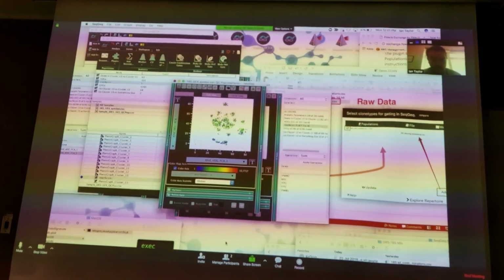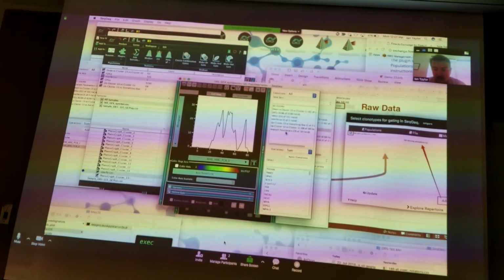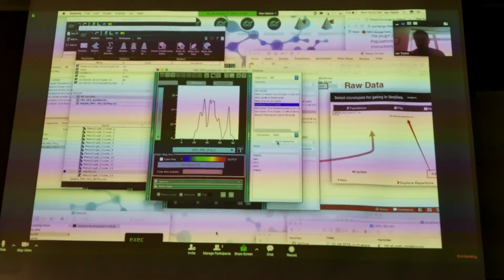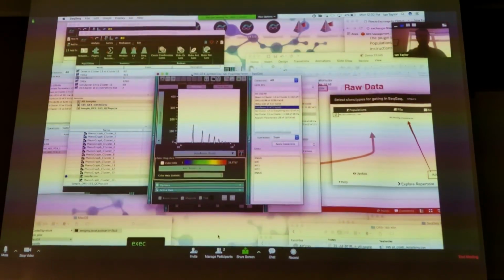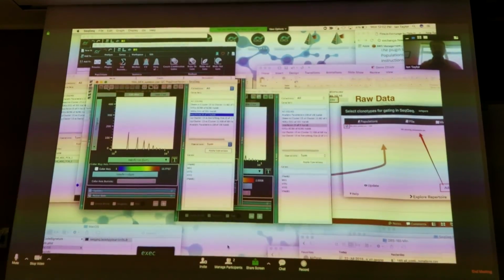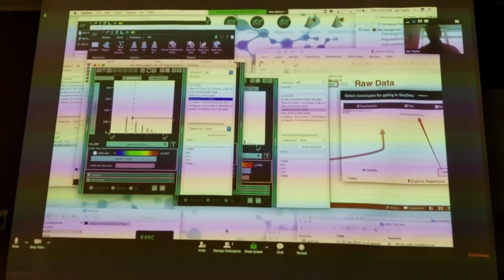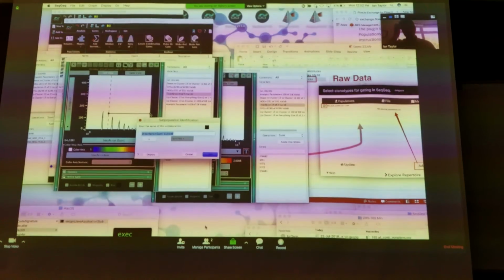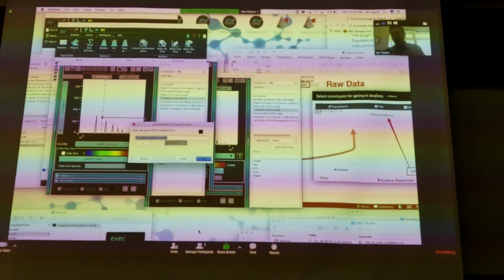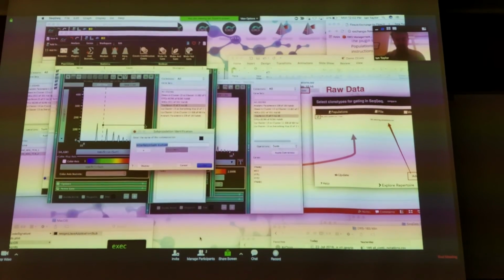Especially for this case, what I would probably do is look at a histogram of that. Now, as I move on to this histogram of those genes, I might note that we probably wouldn't recommend drawing a gate on a T-SNE plot because it is just a visualization. Rather, I would want to find either a k-means or a phenograph cluster that corresponds with that island, because that's a more unbiased way of grabbing all the events that are similar in some way to those that we saw heat mapped in sort of a favorable light.